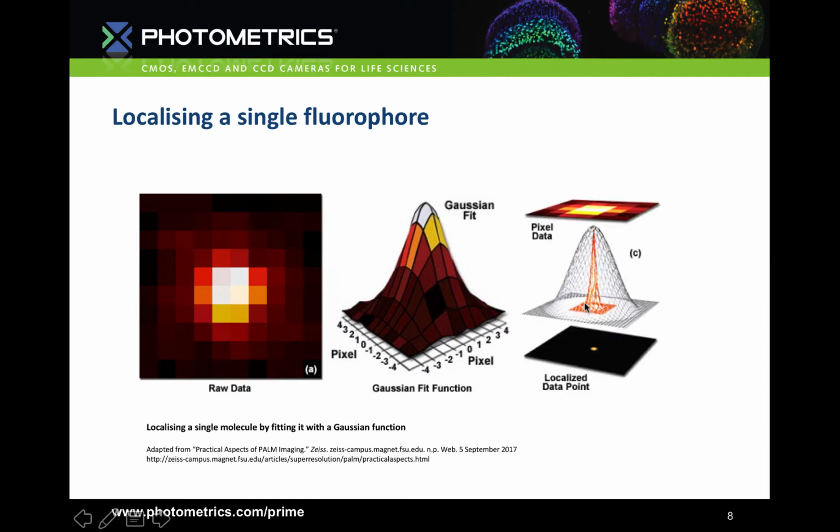The final localized data point gives a far better approximation of the exact location of the fluorophore, which in some cases is down to single nanometers. In this way, we can break the diffraction limit.